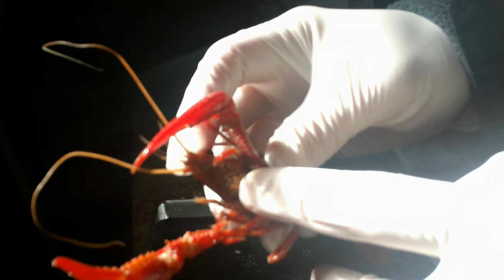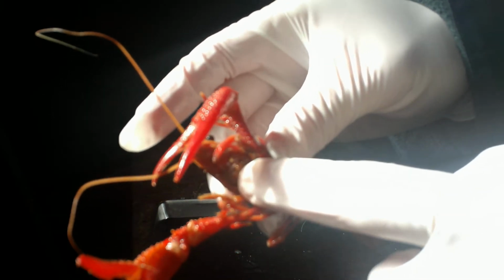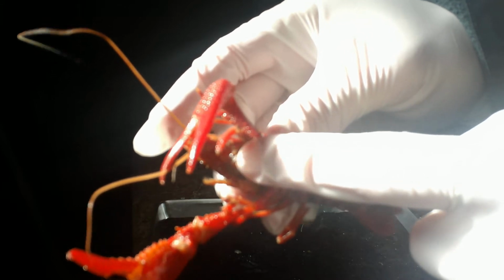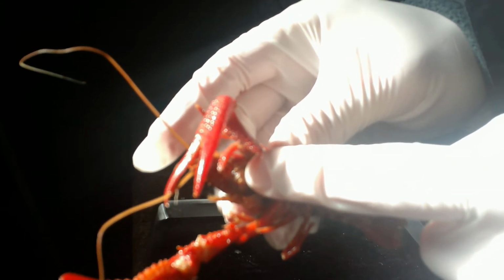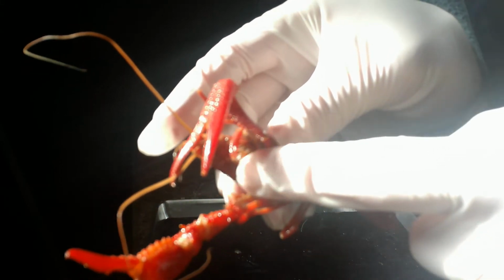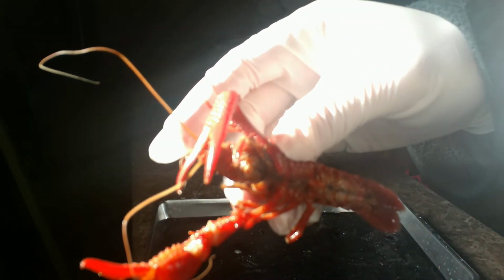So the eyes and the nose are all the way here, and then the mouth is all the way down, just about down by the chelicera, or... Oh, sorry, not the chelicera, the chelipeds. So there's quite a bit of space between there. Okay. So moving down from there, we have eight legs for locomotion, for moving around.